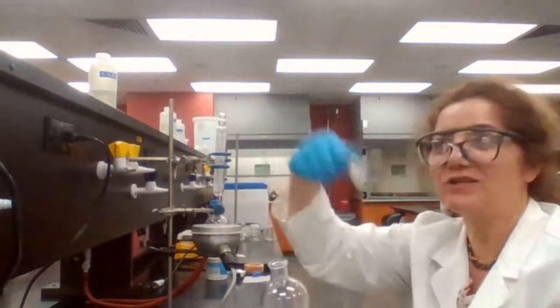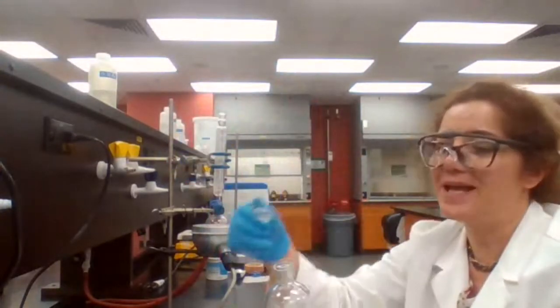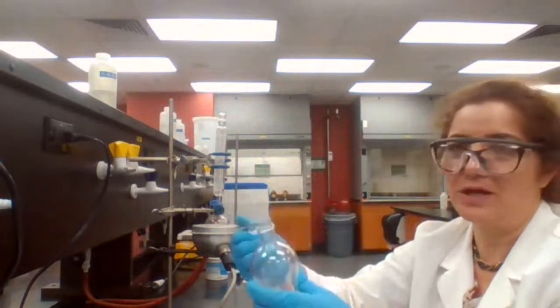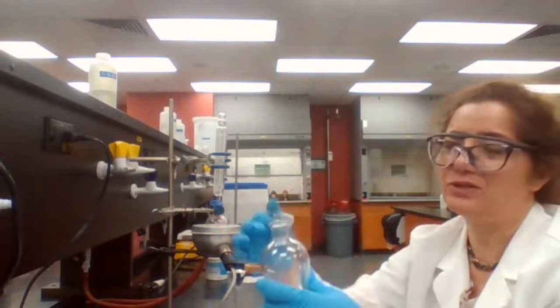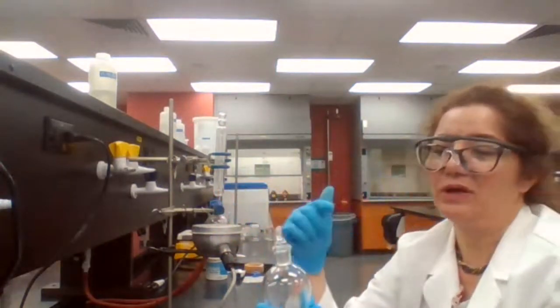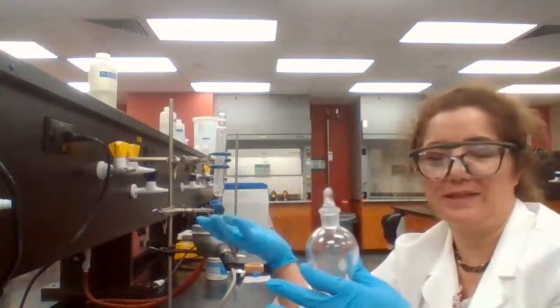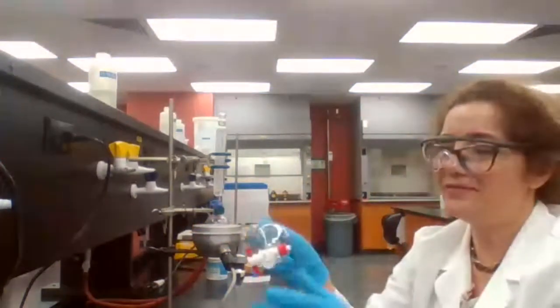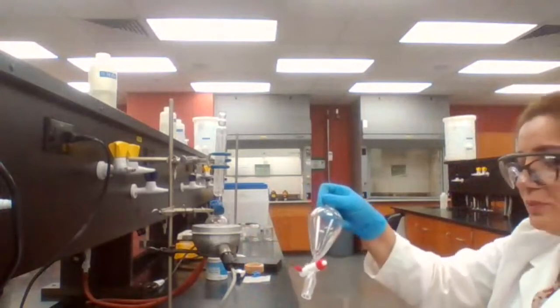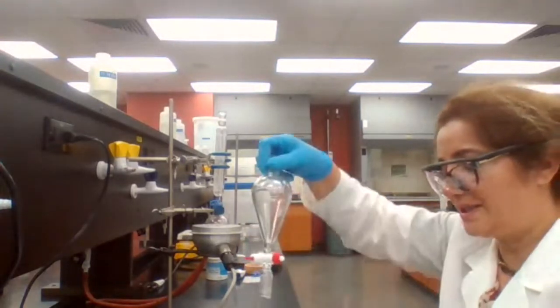It can actually fly a distance. It has happened in the lab when students forget to vent it or leave it there for a long time, or the temperature is high, it builds up pressure, and it is not funny. If it can hit your eyes, it can cause an accident. So you have to vent it a couple of times. So you are doing multiple washings in this case.